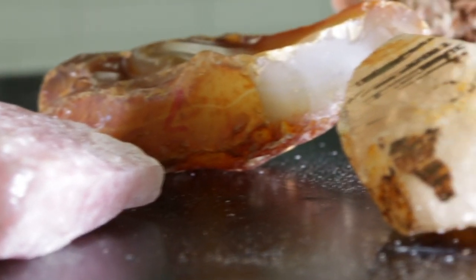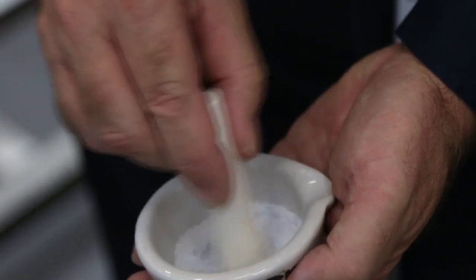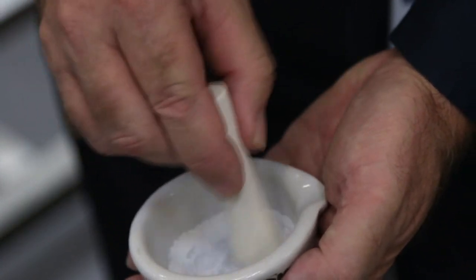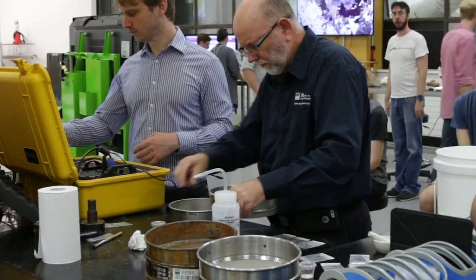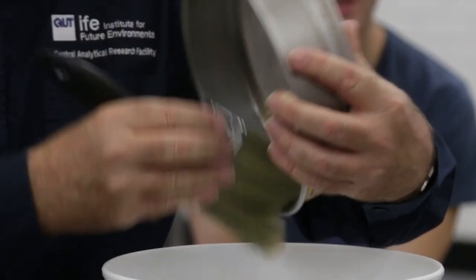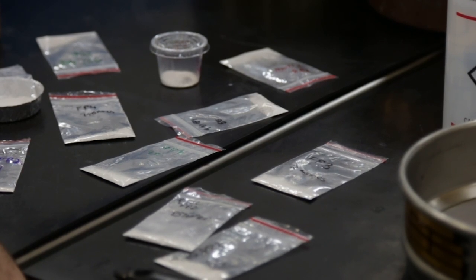It's for a conceptual understanding of geological processes, but in addition it's classic lab work techniques, and we're also using a particular technique called x-ray diffraction, which is very commonly used in both chemistry and geology.